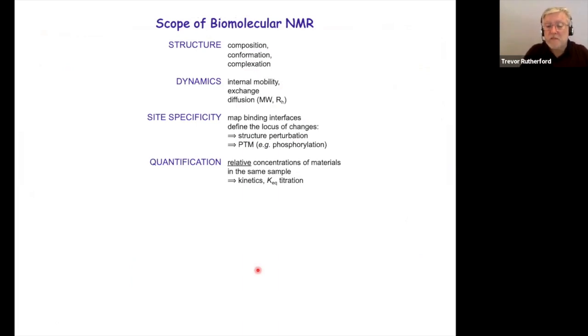So what's the purpose of the investment? What do we expect to do with the investment in that kind of equipment? Well, the primary application of NMR spectroscopy is to look at the composition of molecules, and pretty much every major university in the world now has some access to NMR spectroscopy for the characterization of its organic and inorganic chemistry compounds, its material stuff.